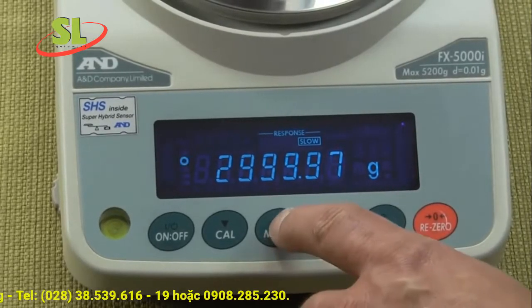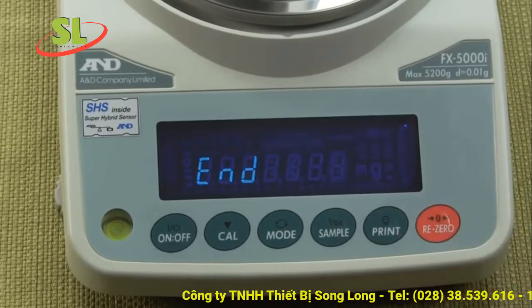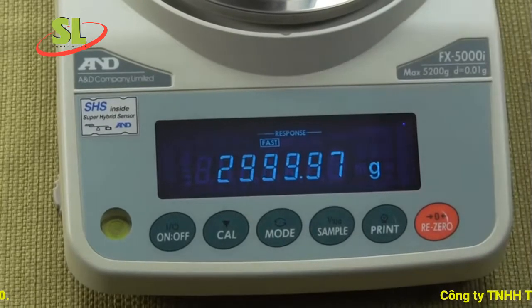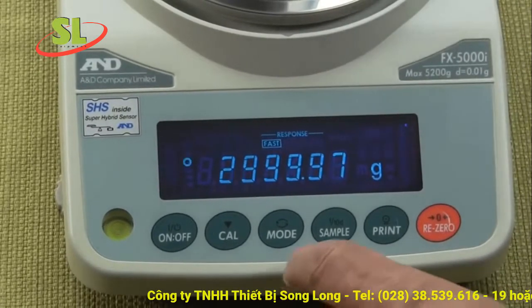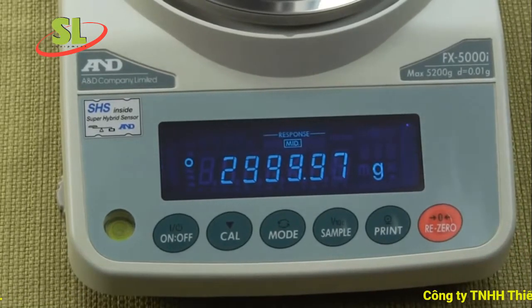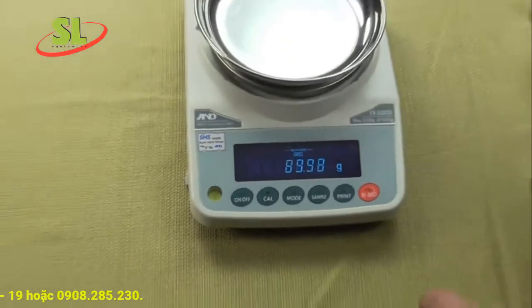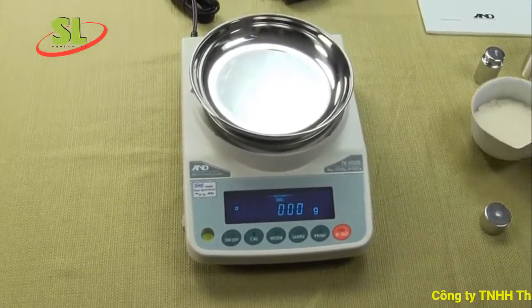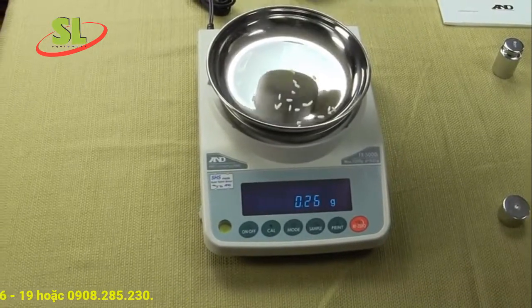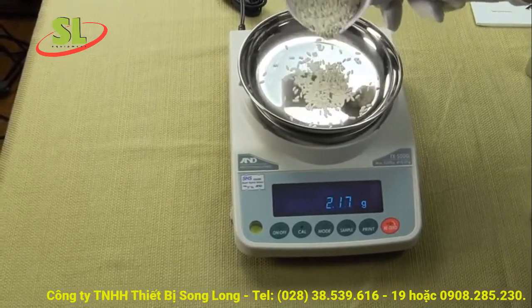Now we'll change it to fast mode. Press the mode button until it says fast, then hit print to store it — you'll see how much quicker the response time is. In unstable environments, fast mode can sometimes be too fast. We'll set it back to the default mid mode. To demonstrate, here's some rice on the pan — you can see the balance is very quick in medium mode for the price you're paying.